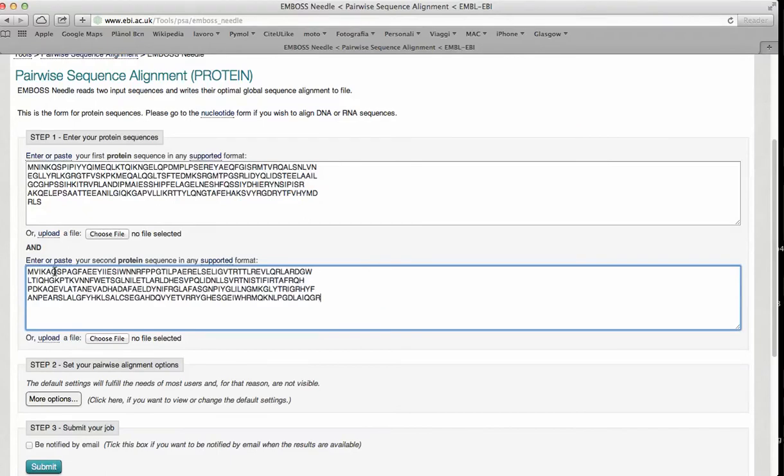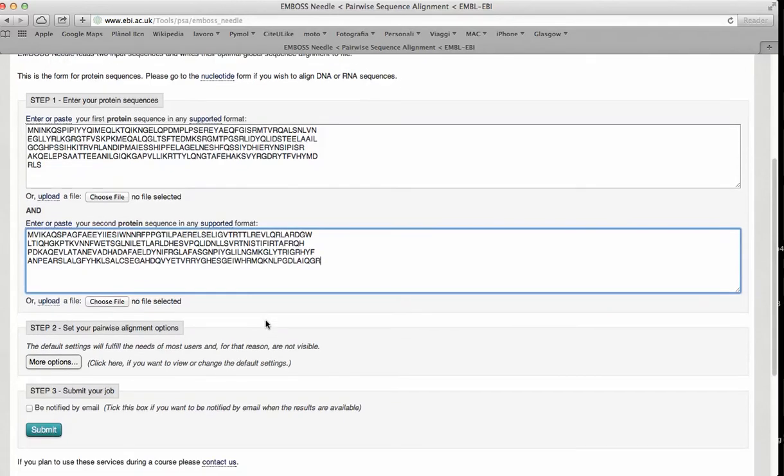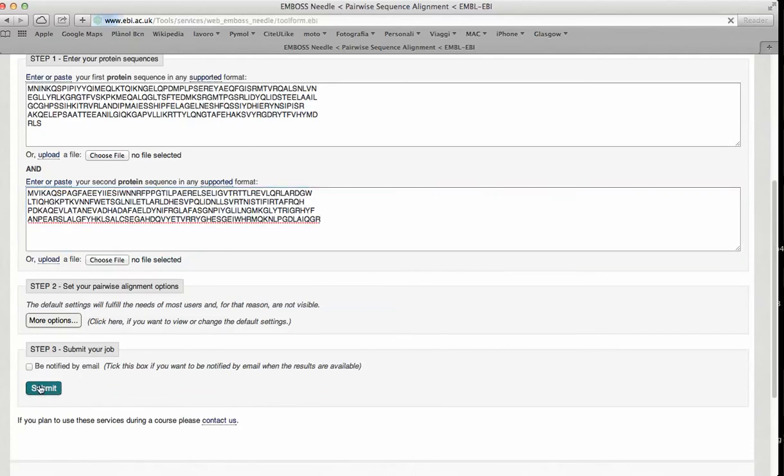And we want to determine where is located. So we submit the alignment of the two sequences.